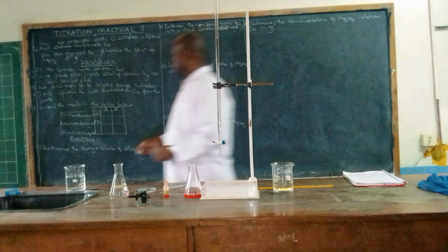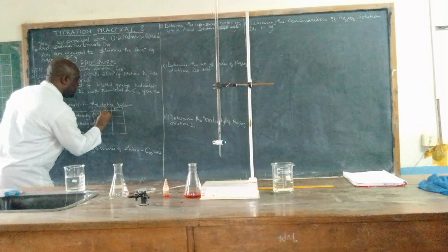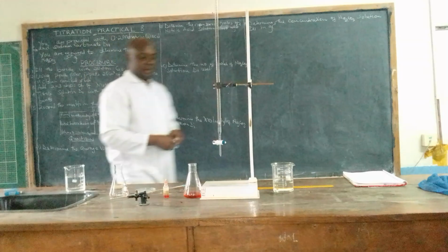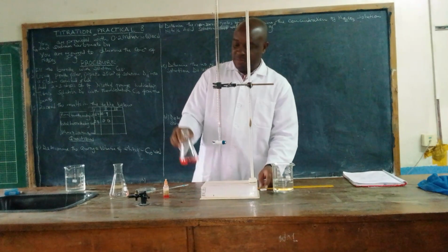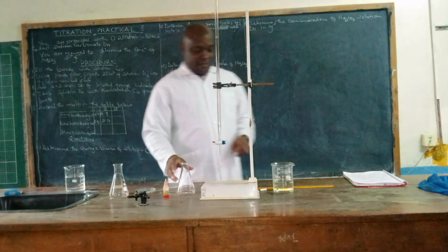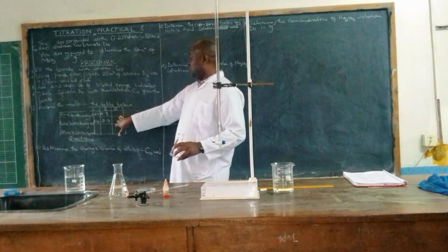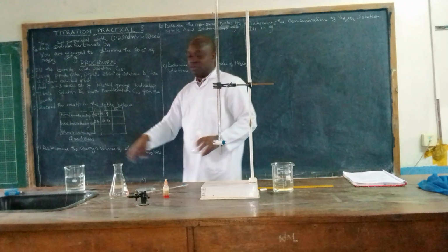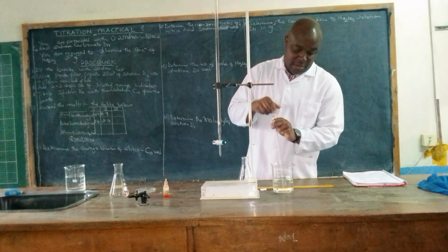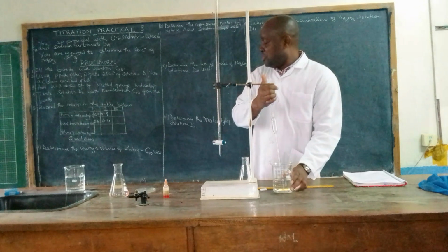So we just come onto our table here and let's write 14.9. Then 0.0 as usual, our usual burette reading, initial burette reading. So I'm just going to drain this. Then from there, we are going now to the third titration. So we are in this column. We are going to titrate 25 cubic centimeters of solution D11.